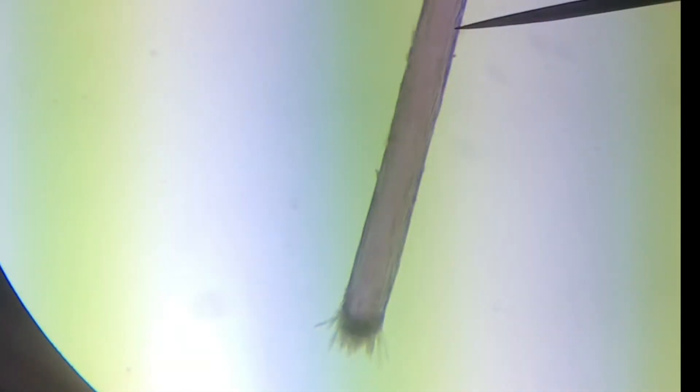And then finally here you can see a strand of hair how it looks if it's been broken or frayed. I actually thought that this initially was one of the strands of hair from my arm but then when I looked at it under the microscope I saw it was purple so I was able to determine instead it was in fact a hair strand from my head that just got broken in half and that's where you can see that frayed edge there.